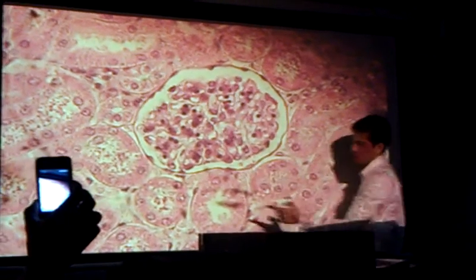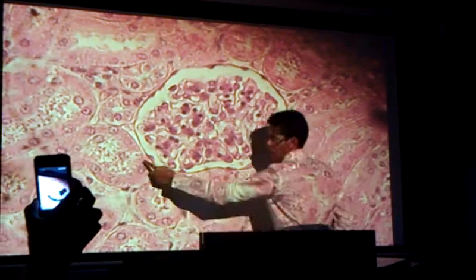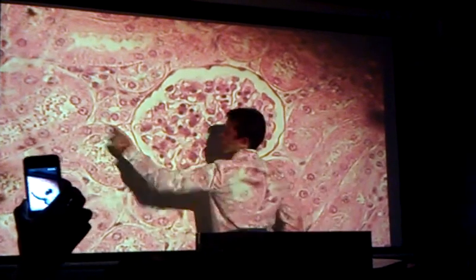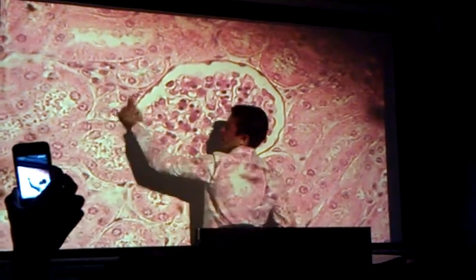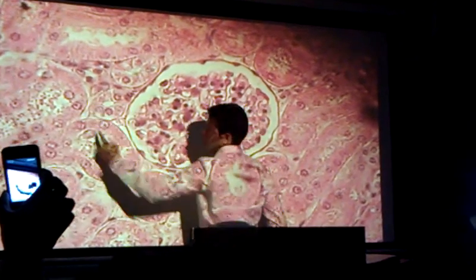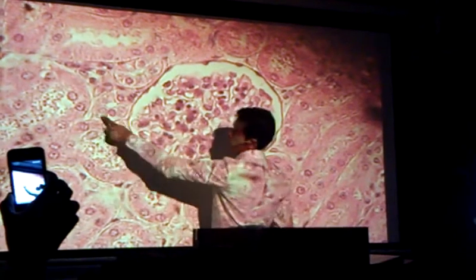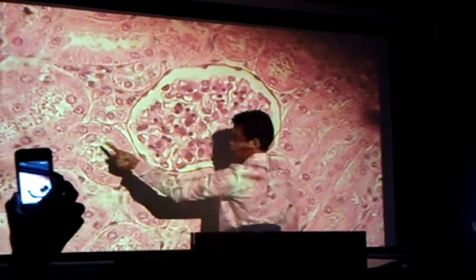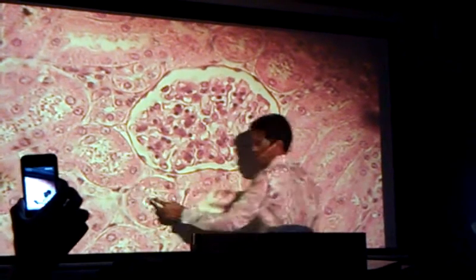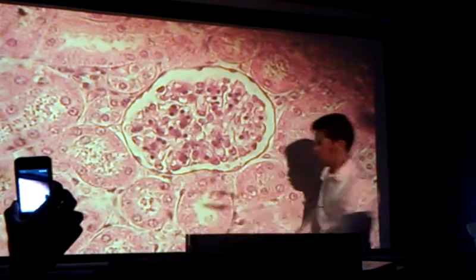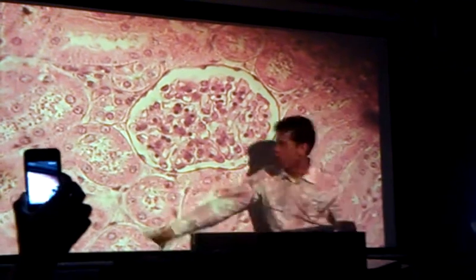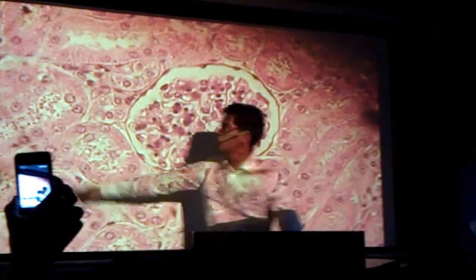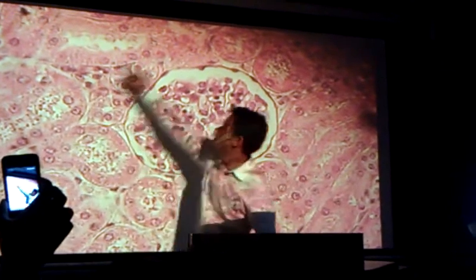The last structures that I need you to identify are these little rounded areas right here. They have simple cuboidal epithelial tissue. These are your proximal convoluted tubules — all of these structures right here outside.